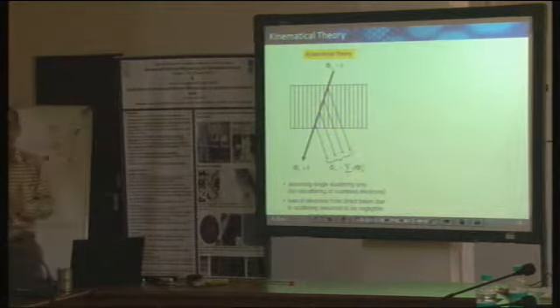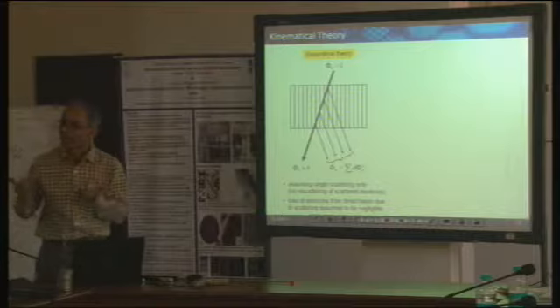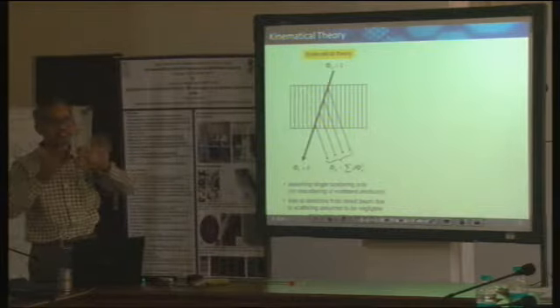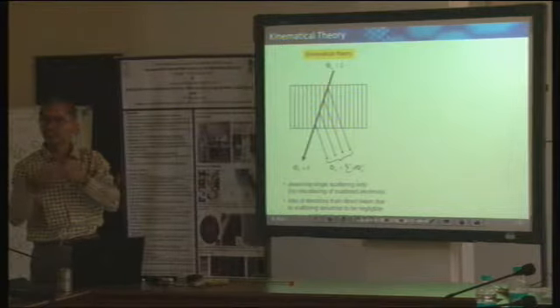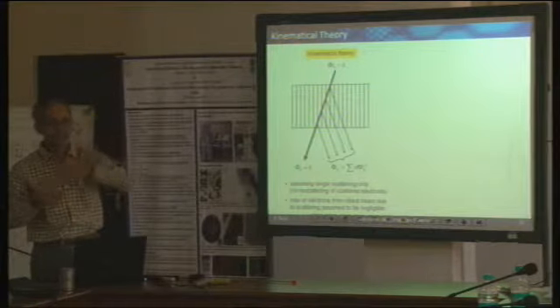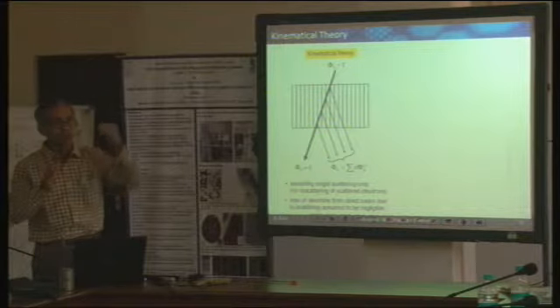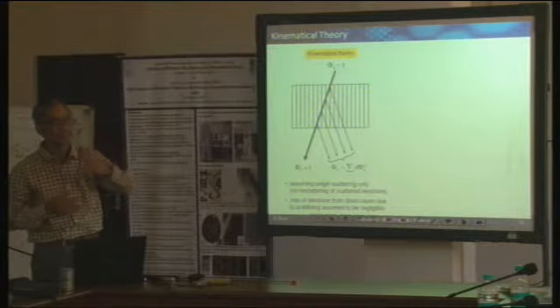Good. Now, when we want to study these diffraction phenomena, you might have probably understood that if there is a sample, an electron beam is falling on it. You have seen in the earlier slides that there is a tremendous amount of interaction between that electron beam and the sample. And one reason why that interaction is extremely dominant is charge-charge interaction. The electron beam is also a charged particle, and matter also contains a lot of charged particles. Therefore, the interaction is going to be strong in comparison to the interaction between light and matter. There the interaction is relatively weaker.